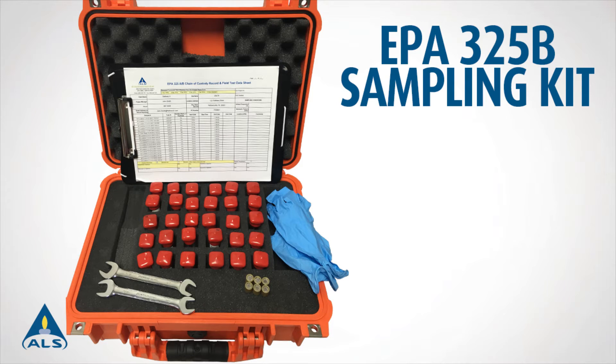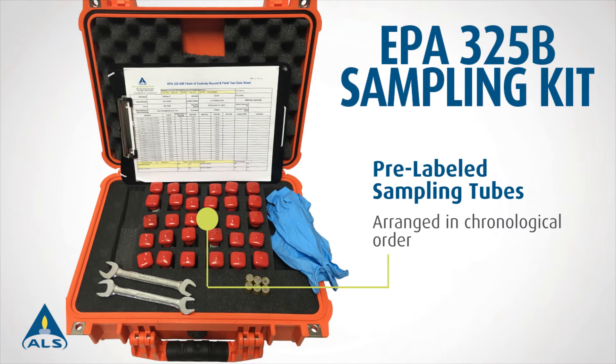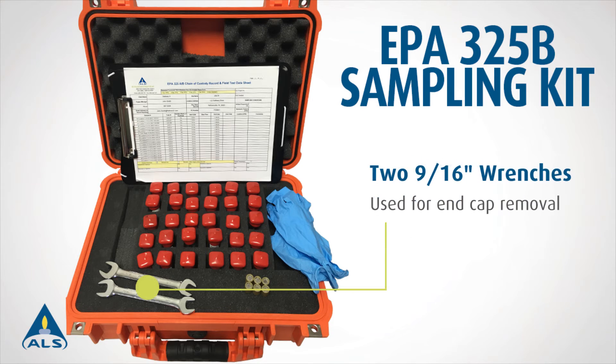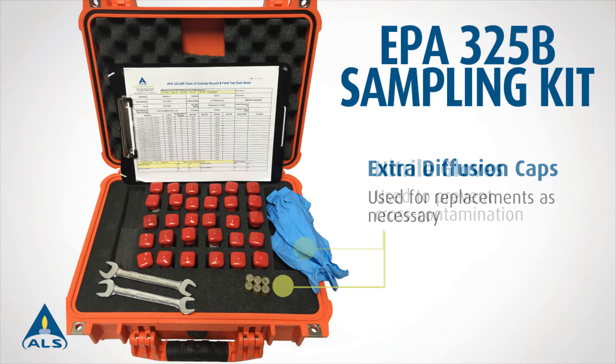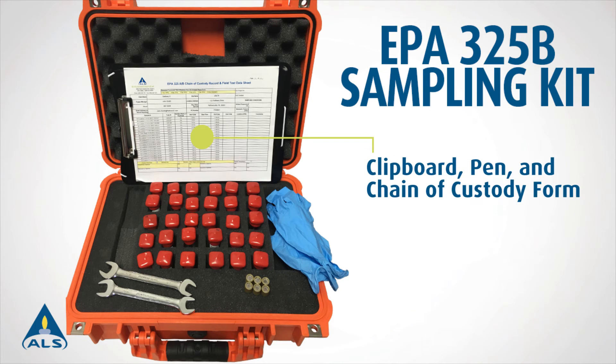Each sampling kit comes with the following items enclosed in a rigid weatherproof case: pre-labeled sampling tubes arranged in chronological order, two 9/16-inch wrenches used for end cap removal, one pair of nitrile gloves used to prevent cross-contamination, extra diffusion caps used for replacements as necessary, a clipboard, pen, and hard copy printed chain of custody form.